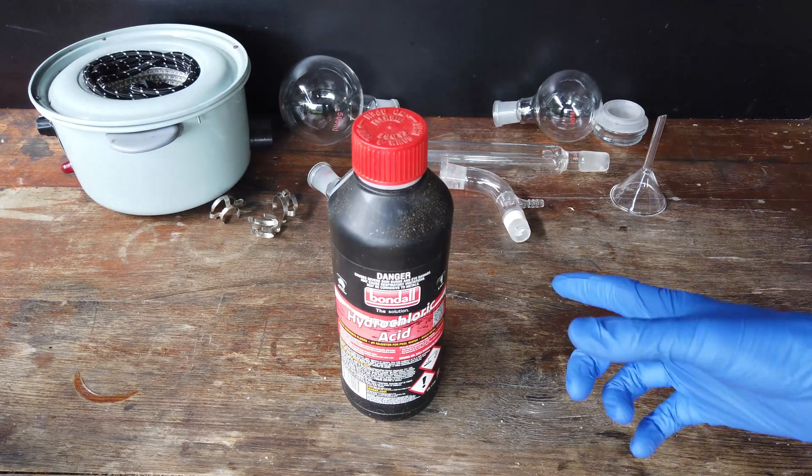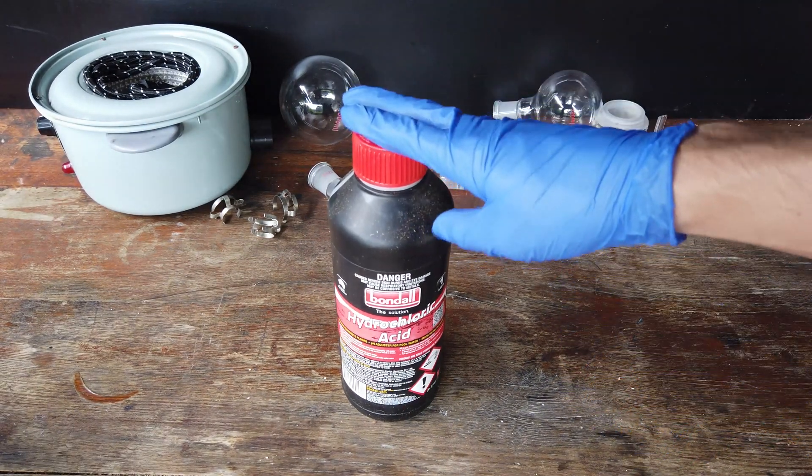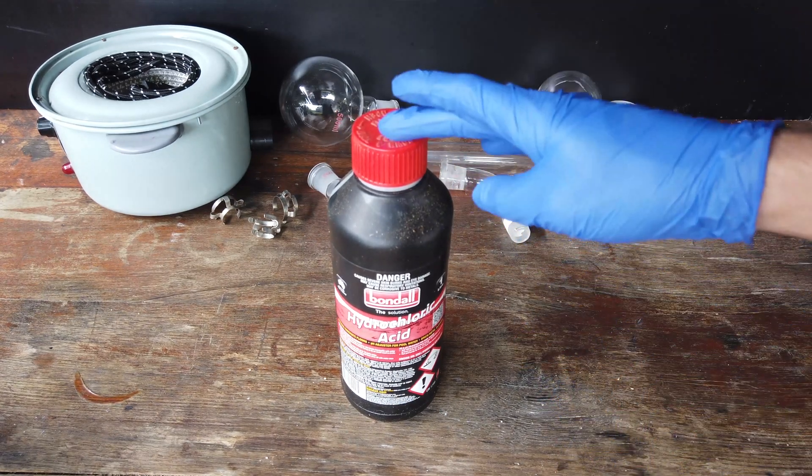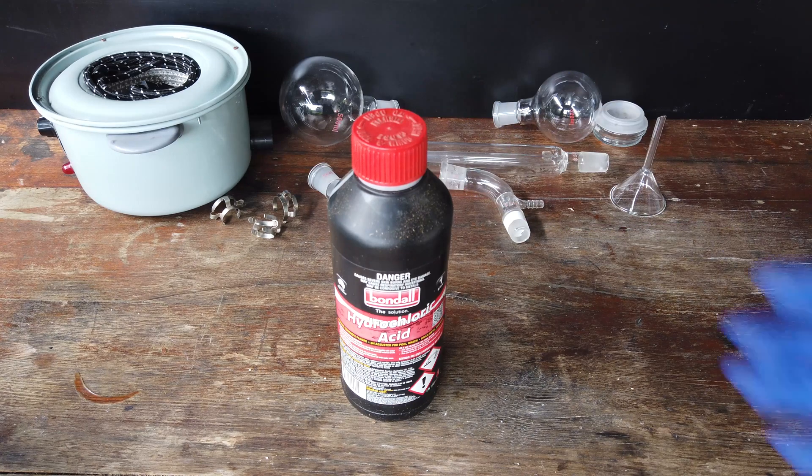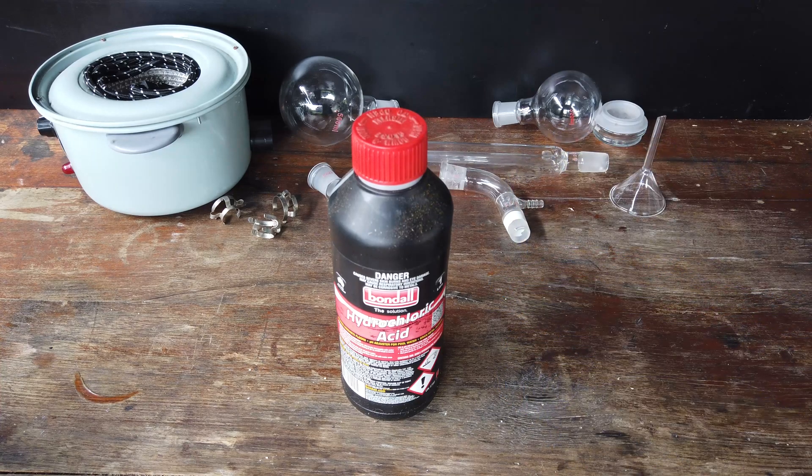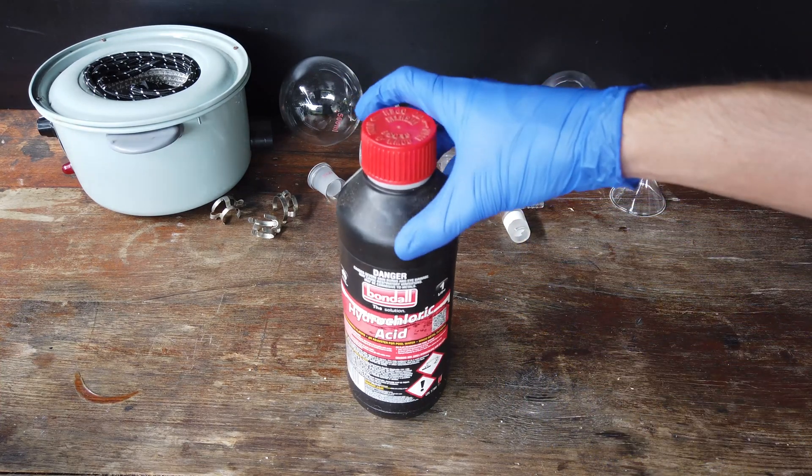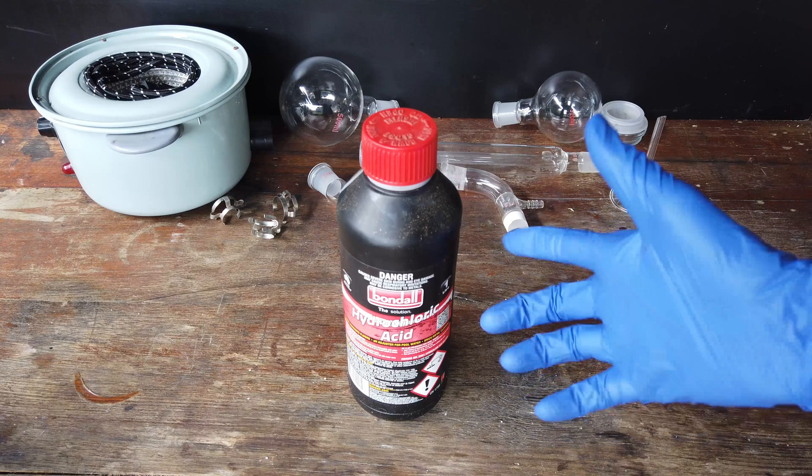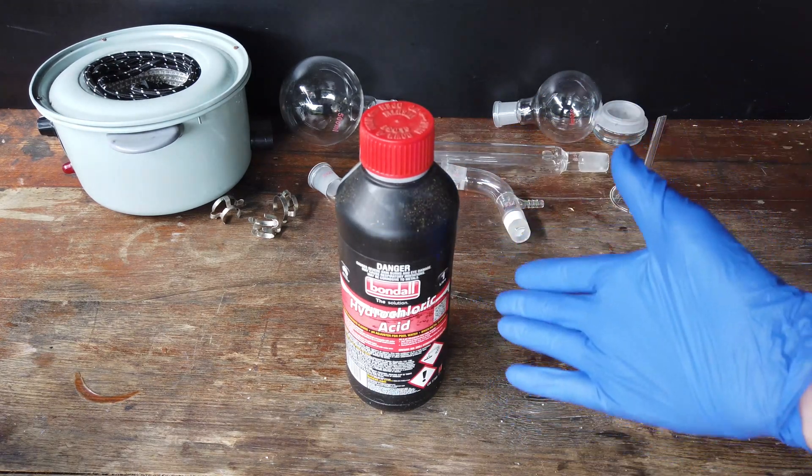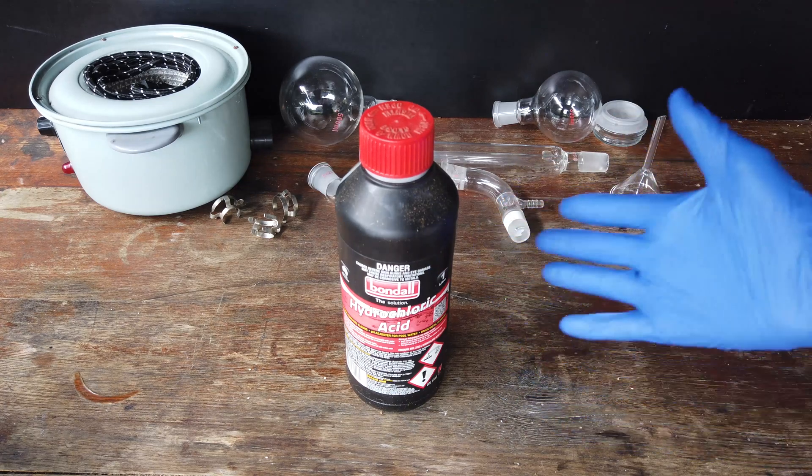There is, however, one issue with the hydrochloric acid that I get from the hardware store, and that is the fact that it contains some impurities in there. People tell me that there's iron in solution, which gives it a slight yellow color, which we will have a look at later. And additionally, I've found that this particular brand of hydrochloric acid that I can get has some kind of redox active species in solution as well.